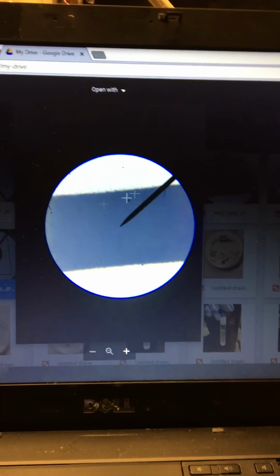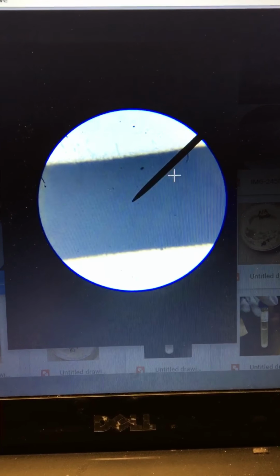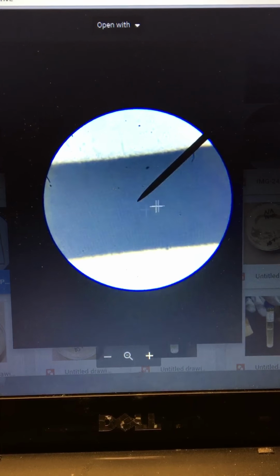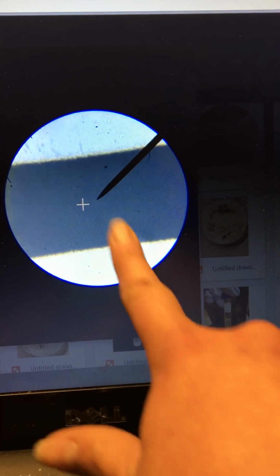And then we have high power. You can't see the majority of the E. This is just the middle of the E that goes like that. So that's in there. It's fuzzy on the edges now. You can tell they're not as sharp as they appeared to be.